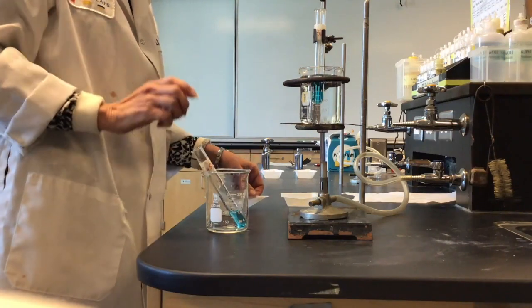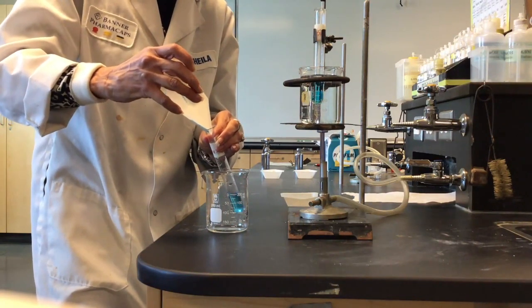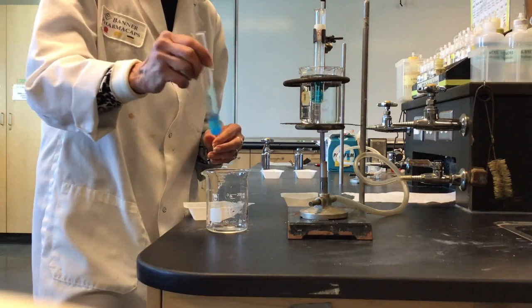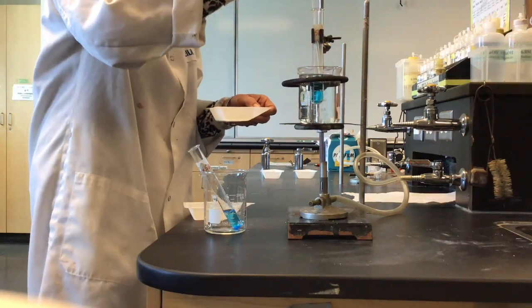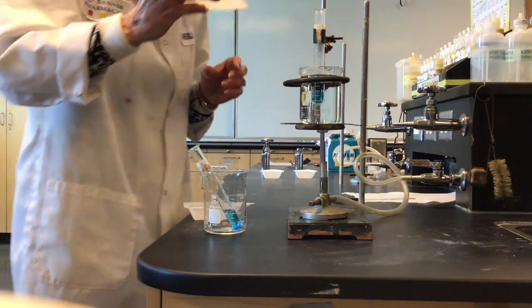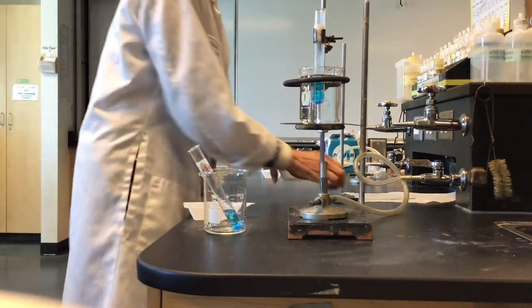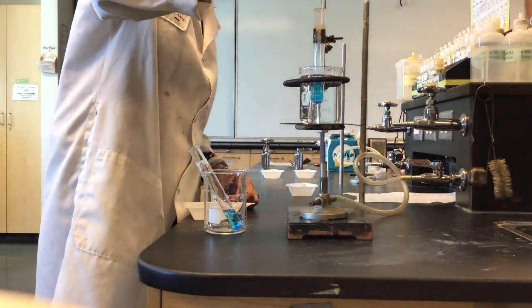So I'm going to go ahead and add another 0.5 gram increment of copper sulfate pentahydrate to this. And I will continue to swirl this to see if I can get it dissolved at room temperature. My sample in the hot water has dissolved, so I'm going to add more sample to that one as well. So I have another 0.5 gram increment of copper sulfate, which I add in here. And the one in the hot water, I'm using the stirring rod because I don't want to touch that hot test tube. And I will mix that one around.